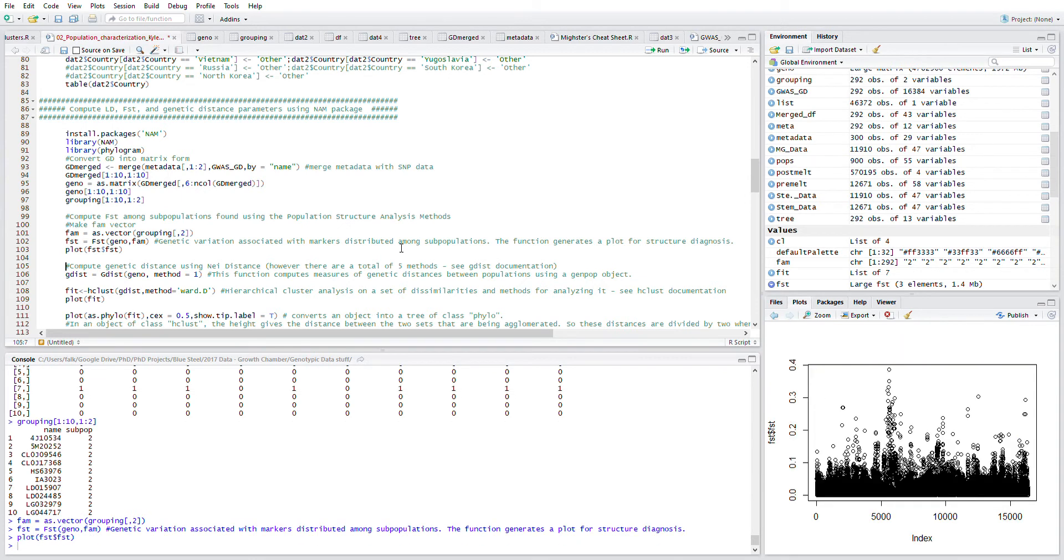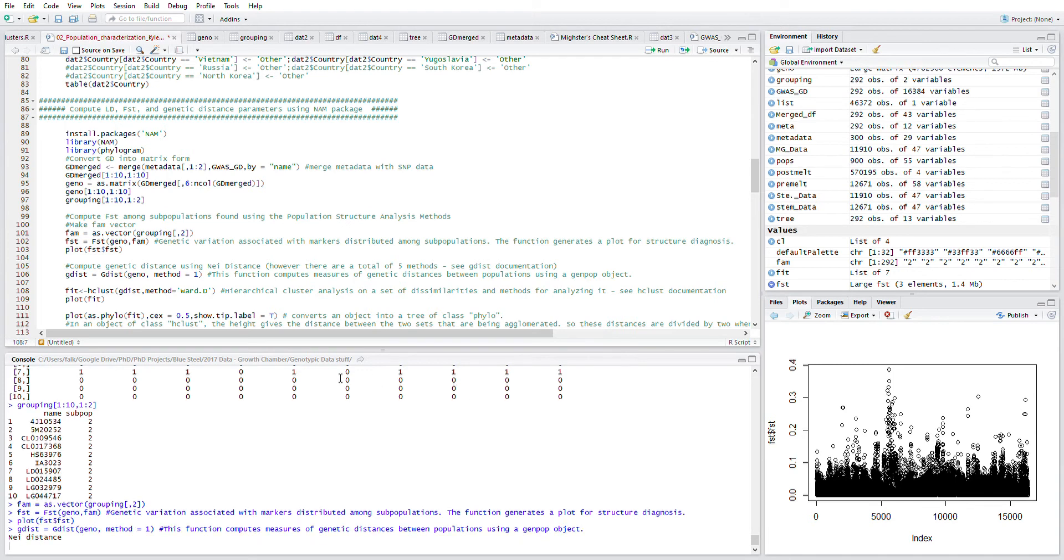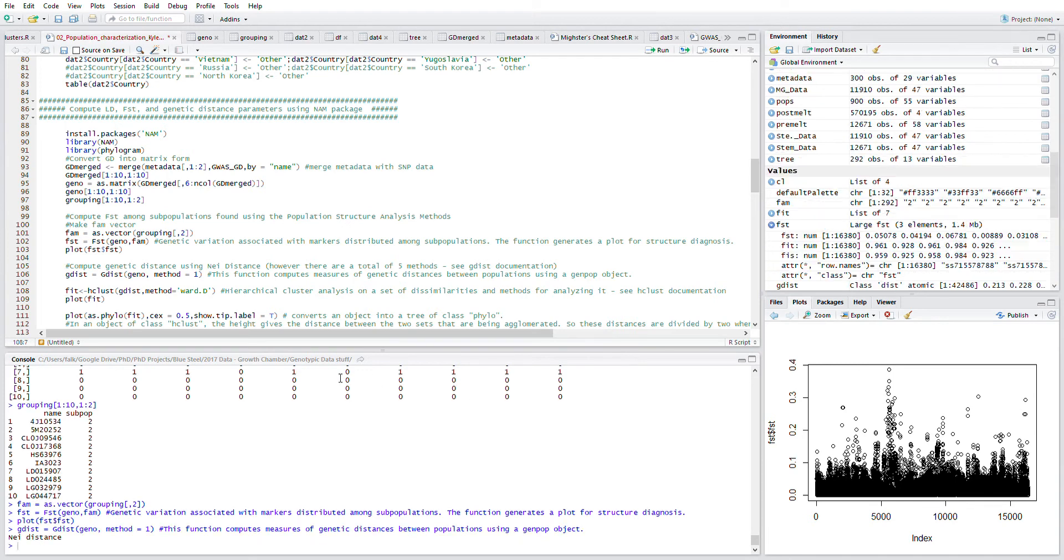We then want to compute the genetic distance using the nigh distance.